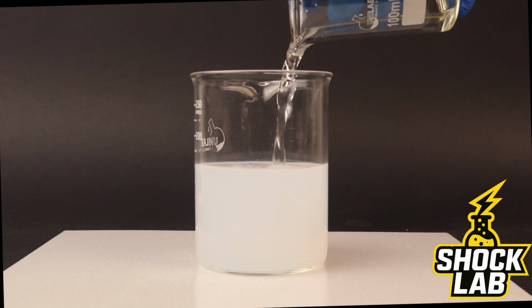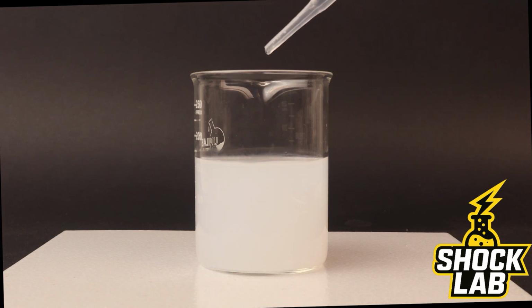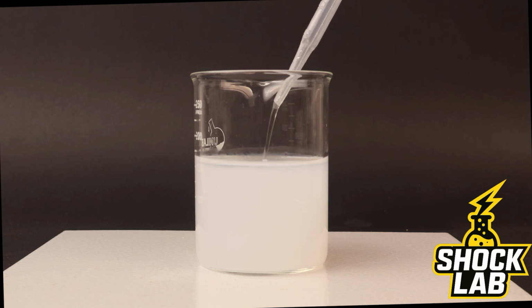Within seconds, the entire solution turns cloudy as millions of tiny silver chloride particles form throughout the liquid. This reaction happens almost immediately because silver ions combine with chloride ions to produce silver chloride, a compound that is practically insoluble in water. At this stage, it looks like the reaction is complete.